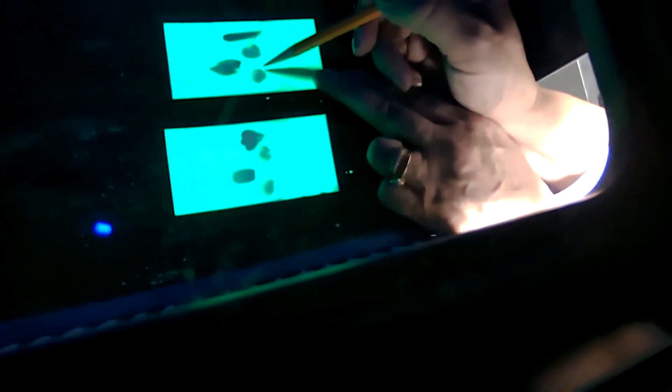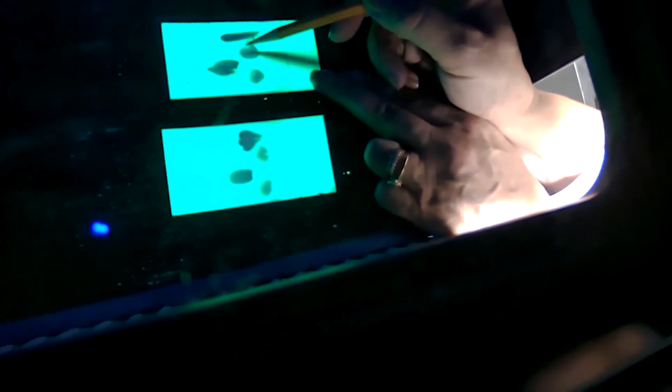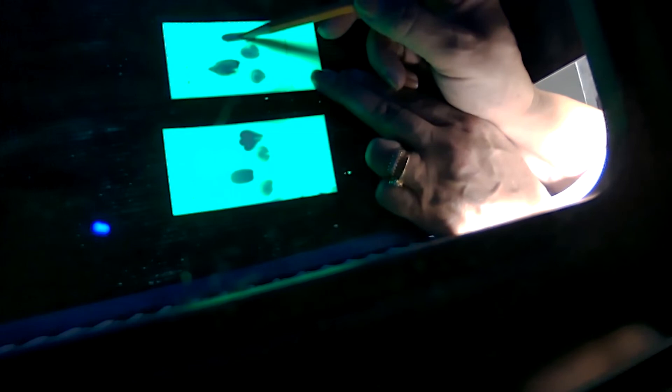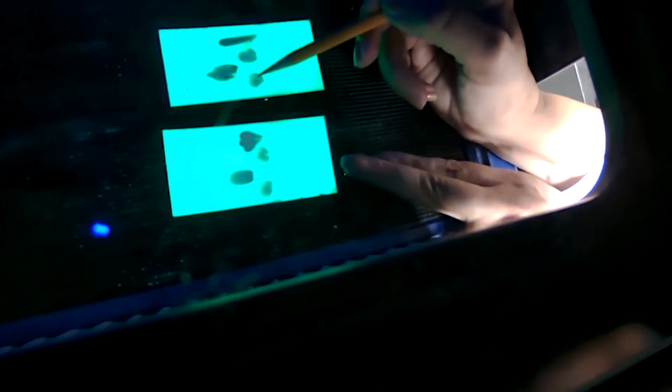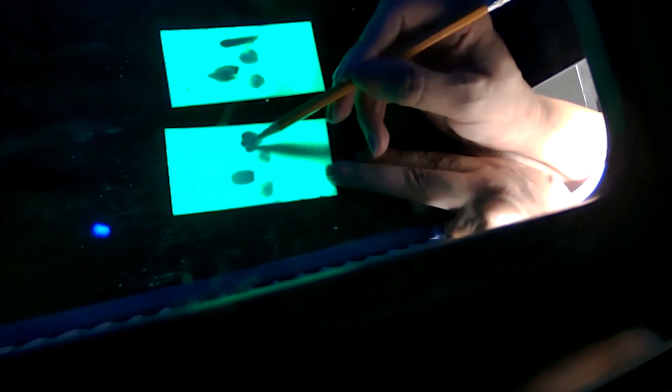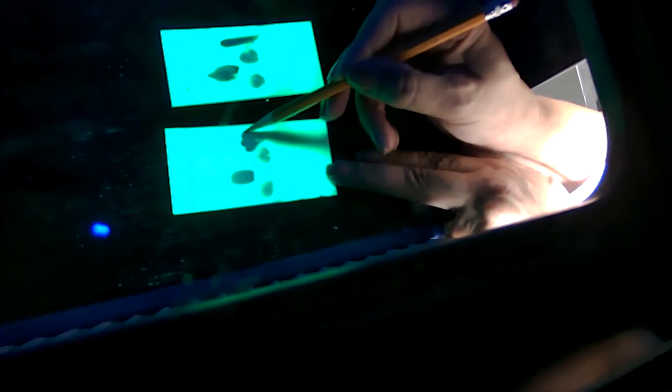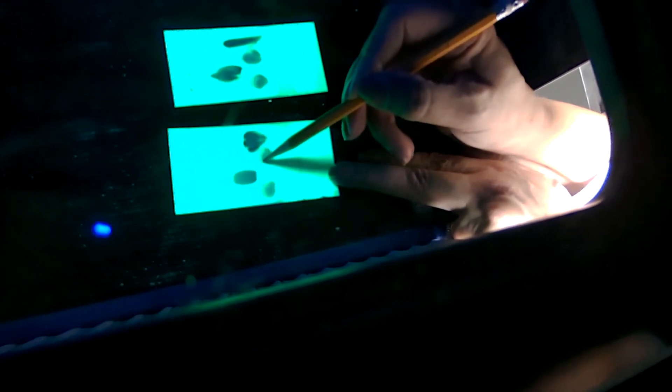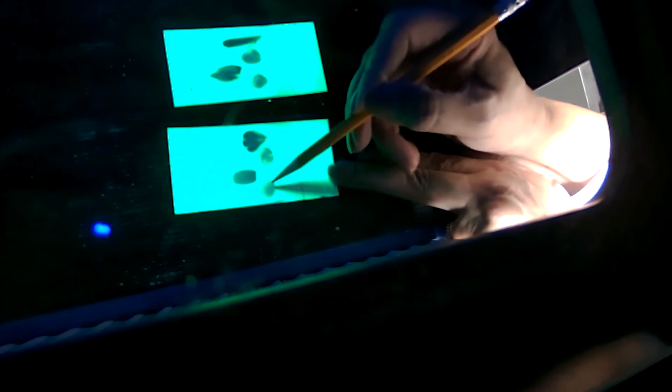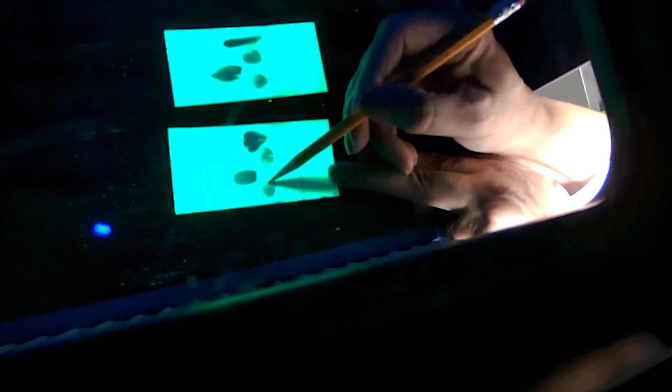You could do the tip to tip and the spots, or you could do the darkest center of the darkest point for each one. And I'm going to also mark these circles right here, spots here. That's the one with the big drop that I didn't like and that's why I repeated or I made the two samples.